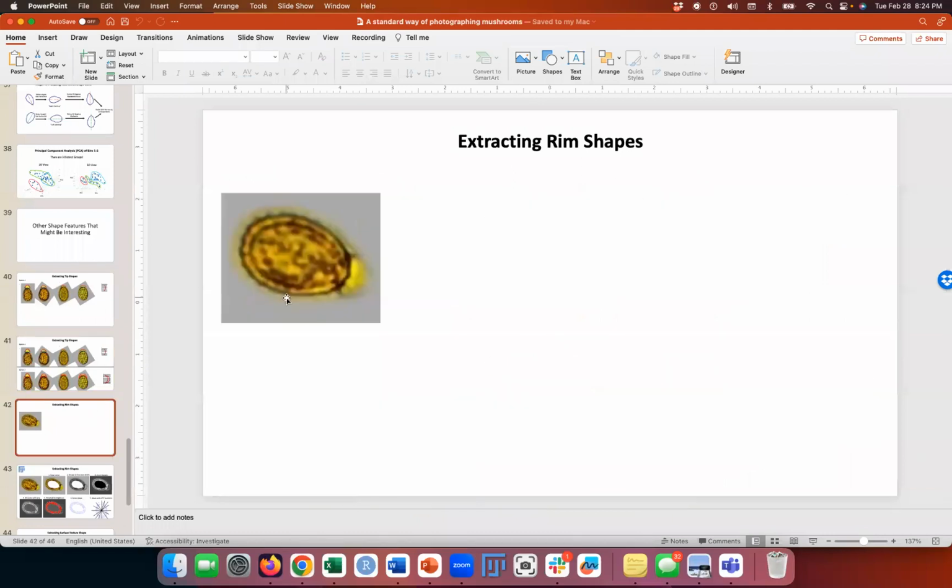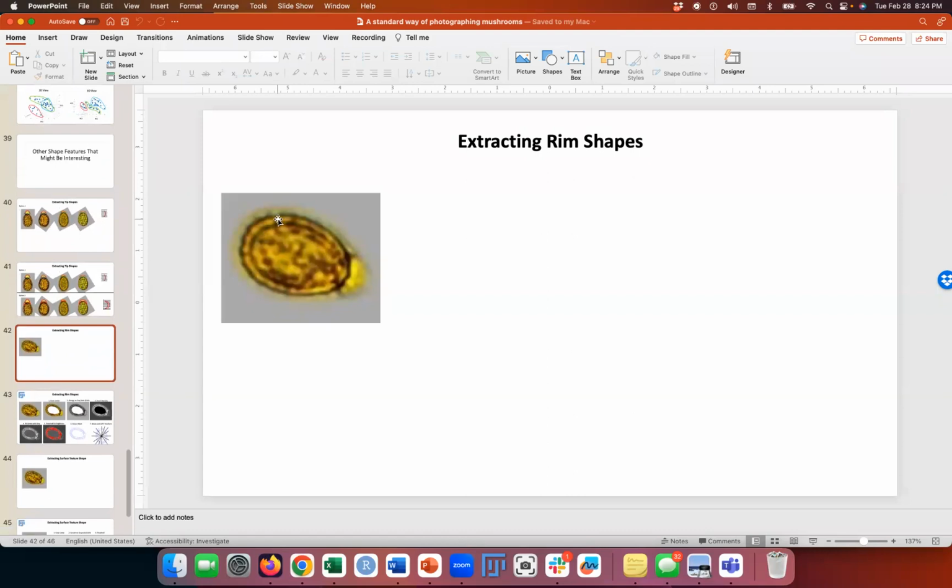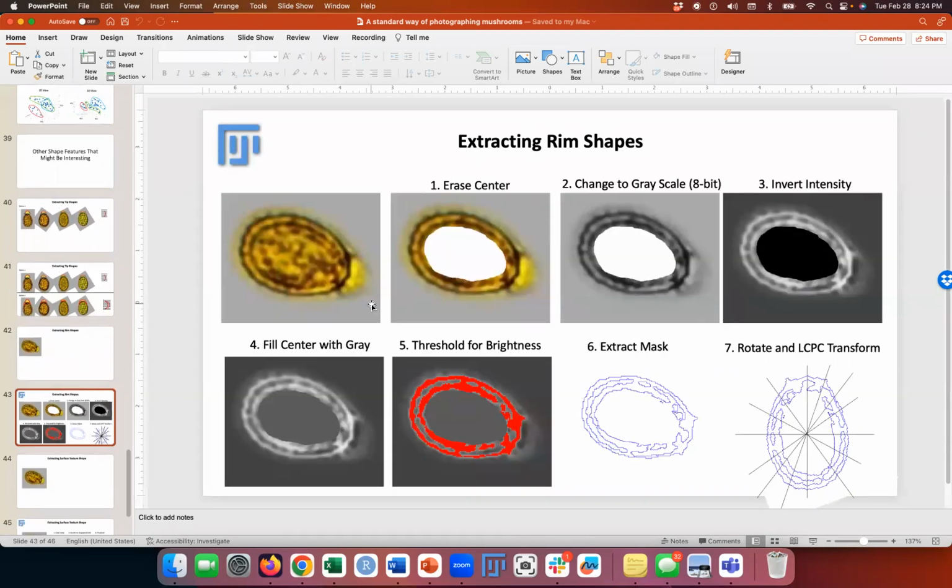All right, and then in terms of the internal structure of the spores, there's just 2 rings, right? 2 black rings you can see. And for here, the image was too fuzzy for me to outline by hand. So I decided to use ImageJ to just threshold. And I was able to, through basic ImageJ features, isolate the shape of these 2 rings, right, in a way that was objective. Okay, and I would rotate it to be vertical like this and then do radial grid processing.